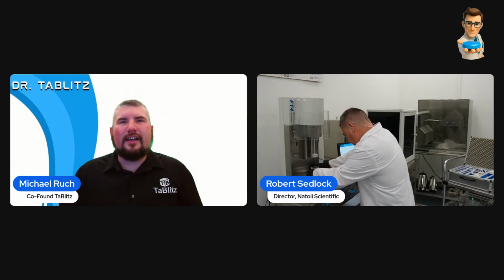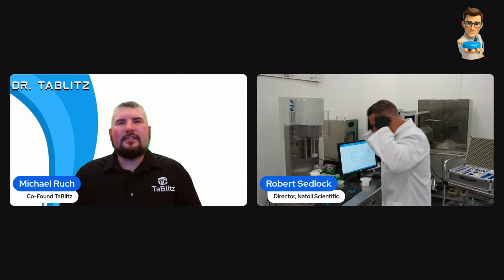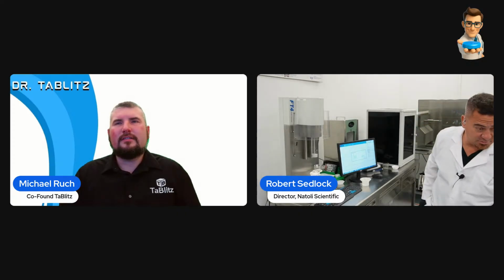How you doing? Was that a powder rheometer? I think I see the FT4 there in the top left. Yeah, I'm running the powder rheometer, some advanced powder characterization.